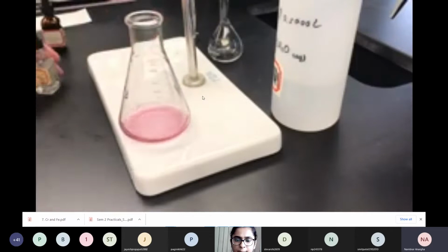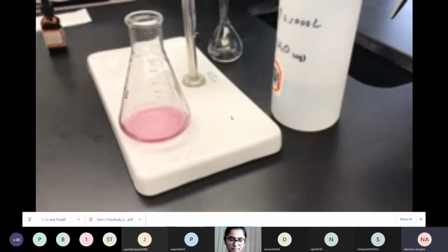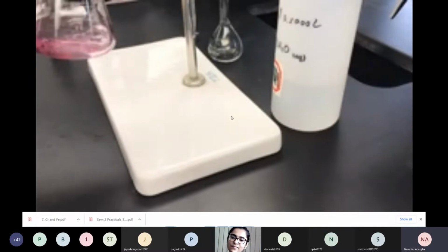And then the next thing we're supposed to add is 10 drops of the magnesium EDTA solution. So that turns out to be about a dropper full, but we'll go ahead and count them out. 1, 2, 3, 4, 5, 6, 7, 8, 9. We'll get that last one, 10. There we go. All right, so at this point, I'm going to go ahead and shake this up nicely, make sure we're in good shape.